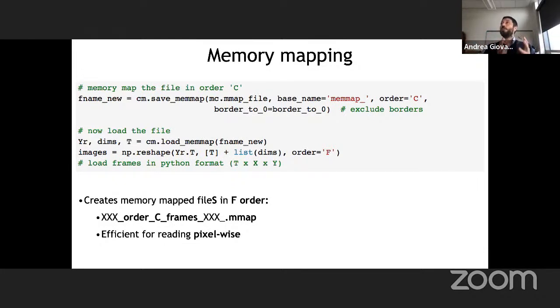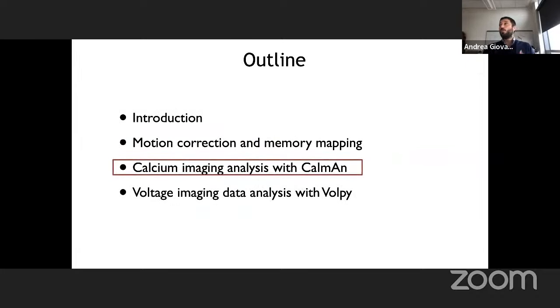But I want you to be aware of the creation because these big data sets are going to fill space in your hard drive, and can of course be erased afterwards. But also you want to know how to use them properly in case you want to customize the software. Perfect. So we are now left with the original file and 2 copies on the hard drive of this file, one that is easily readable frame by frame and one that is easily readable pixel by pixel.